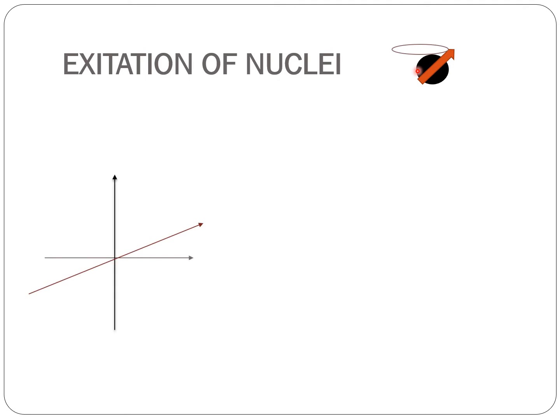But if we take it in the XYZ axes and pass an external magnetic field B0 in the direction of the Z axis, where the external magnetic field is applied along the Z axis.